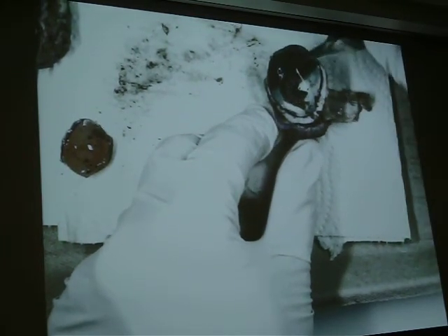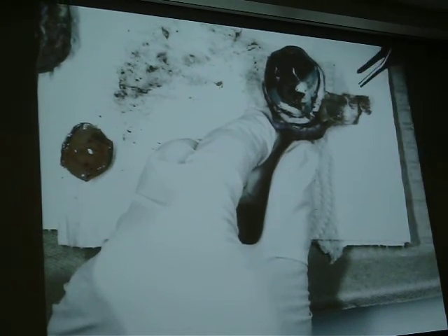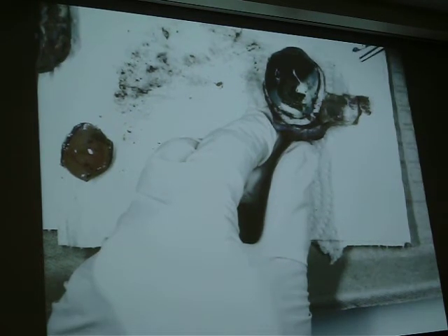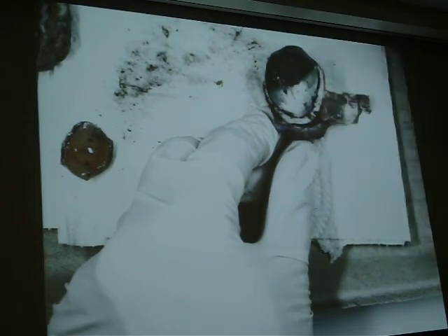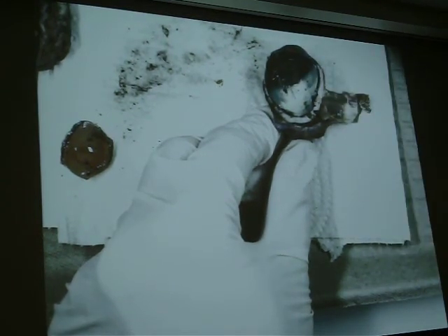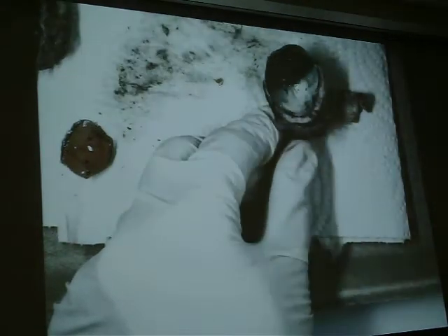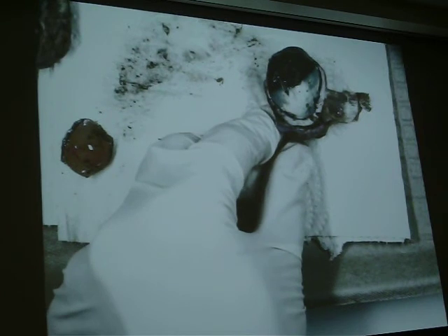Now this layer here — see the black and the silvery-blue? All of them together are a choroid. The silvery-blue part has its own subcategory: that part of the choroid is called the tapetum lucidum. And that's going to be in your list. That is the part that shines at night when you shine a light into the animal's eye, so the light comes through the retina once, bounces back out through the retina, so you get a double dose of light for stimulating those neurons and photoreceptors.